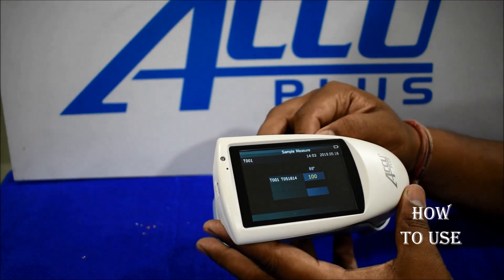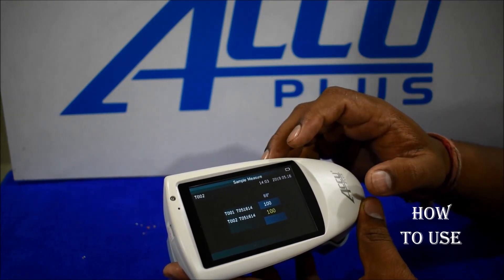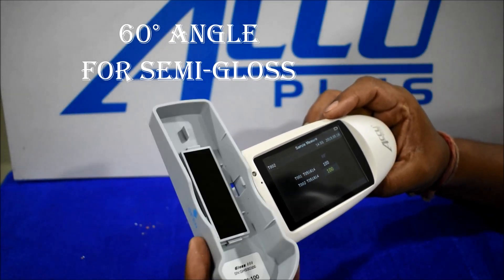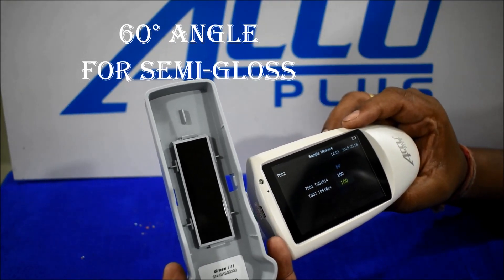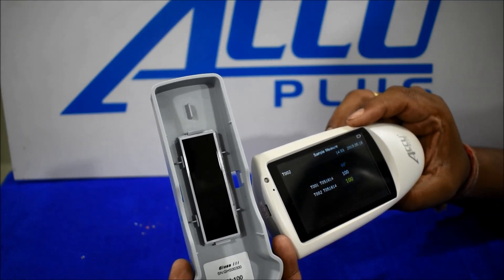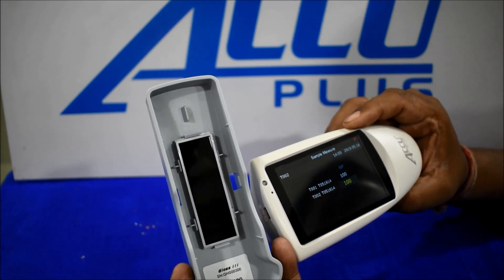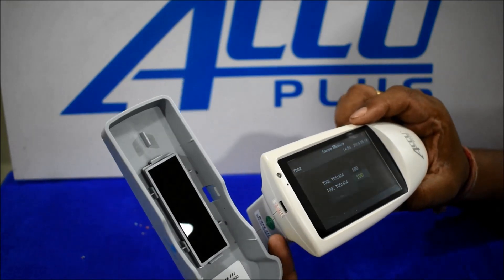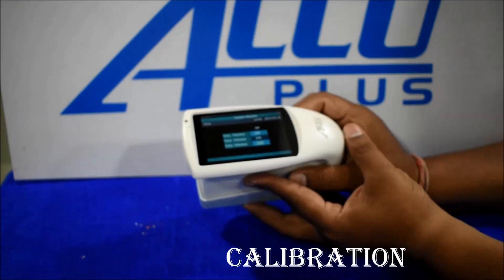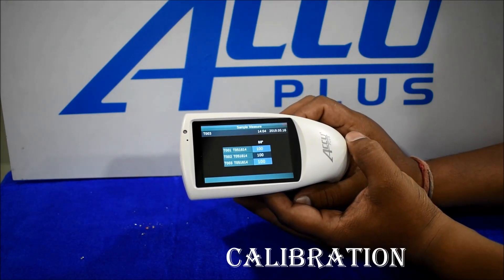For any glossy product, to get a quarter reading, we already have a calibration block inside — like this. We have given 60 angle and 100 reading on the gloss meter. Reset by self — close calibration mode. If you want to calibrate or if there is any reading difference, go into calibration mode.